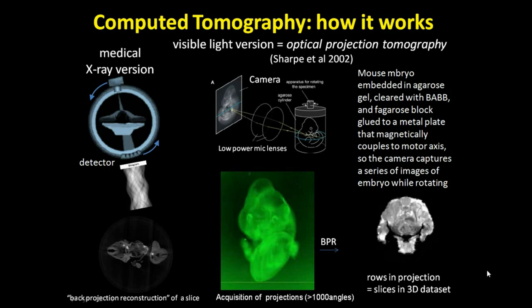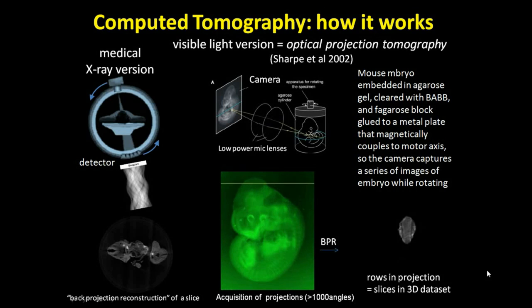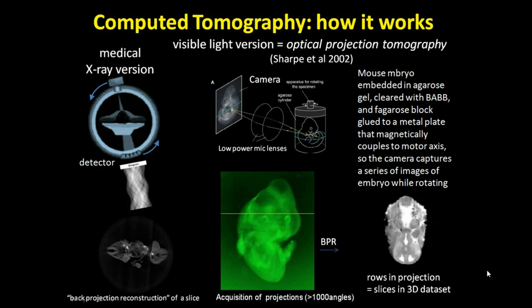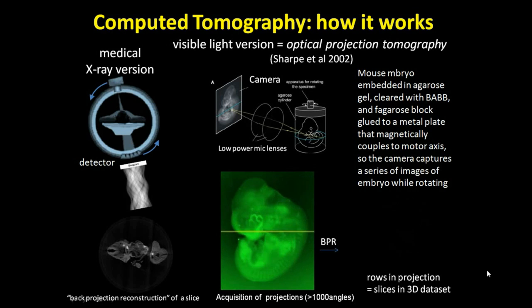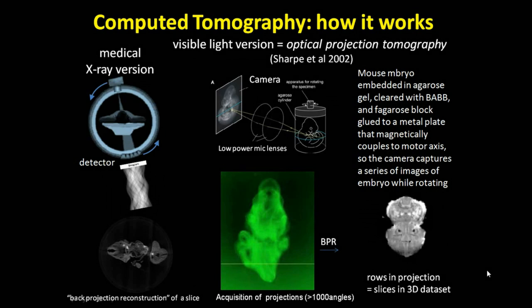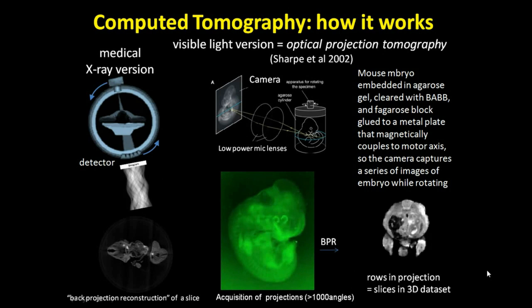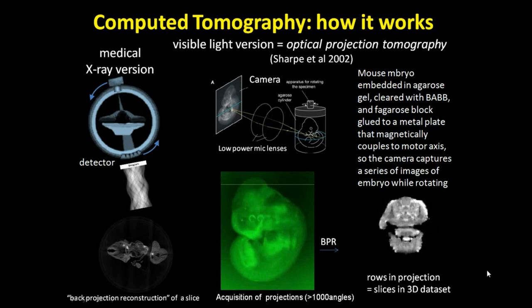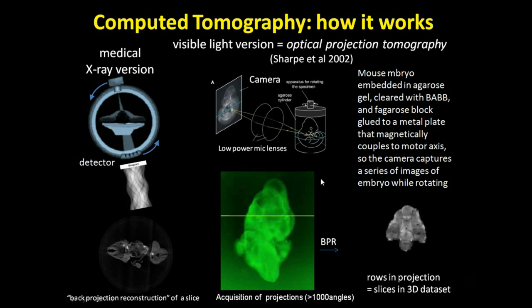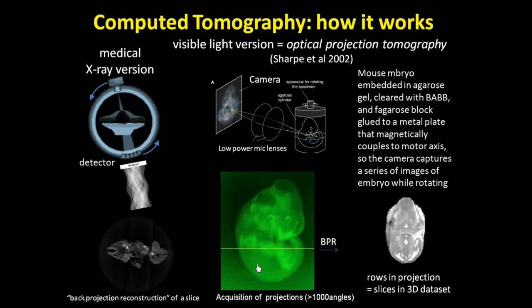When you use oil, you dehydrate the sample, you replace the water by oil, by embedding it in an oil, you get a homogeneous refractive index across the whole sample, which makes light go through it without much scattering. You can still see the details of the organism. It doesn't disappear literally. It's just not scattering light as badly as it was before when it was alive. And now you can actually see through it, just like you see on this mouse embryo. You can now see internal details.